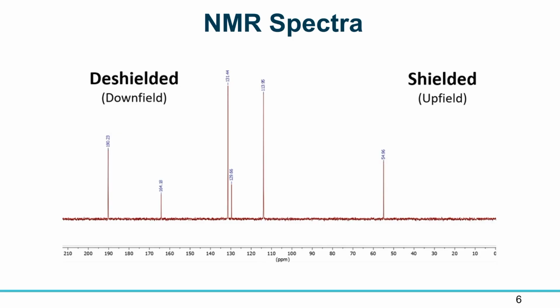Historically, the terms downfield and upfield were often used as relative terms to describe the position of a signal in a spectrum. These terms originate from the first NMR instruments, which analyzed samples by holding radio frequencies constant and swept from low to high magnetic field strength. While this instrumental design was made obsolete in the 1960s by the development of modern Fourier transform NMR, the terms downfield and upfield are still frequently used.